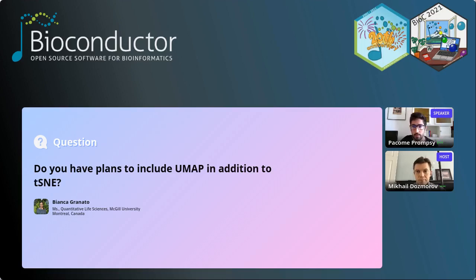Pearson correlation between cells, and we use this as a similarity metric, and use this as input for the hierarchical clustering. So you can either run simple hierarchical clustering, which could be quite not robust, but you could also run consensus clustering. And this is using a Bioconductor package, which is ConsensusClusterPlus. But it is resource heavy, so it depends on the size of your datasets. But this can help you detect the right number of clusters.